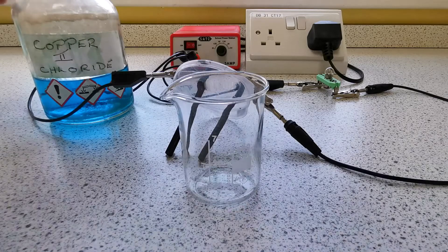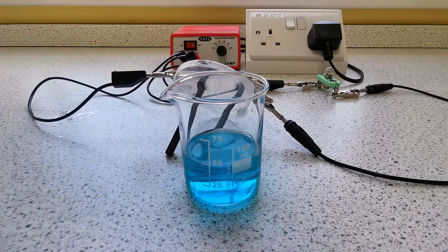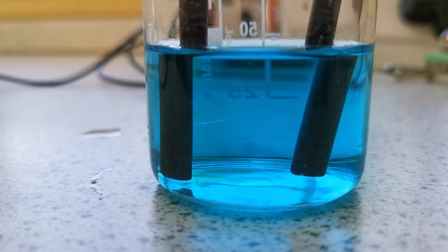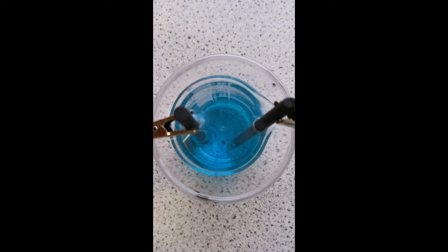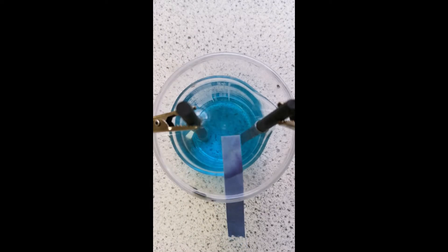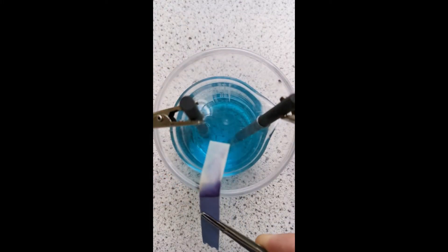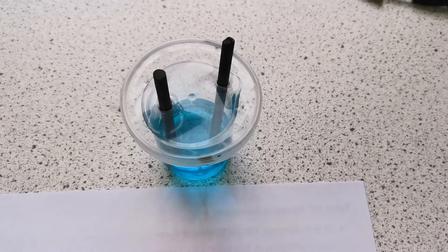I'm going to repeat the method again, this time with copper chloride — once again 50 milliliters. Then we're going to put the electrodes in and start the circuit. As you can see, we have a gas being produced at the anode but no gas being produced at the cathode. I'm going to test for the presence of chlorine gas using a piece of damp blue litmus paper, trapping it between the lid and the beaker. As you can see, the chlorine gas has bleached the damp blue litmus paper and it's turned white, confirming that chlorine gas was produced at the anode. And if we lift the electrodes out of the solution, you can see that the cathode has turned orange-brown — it has been plated with copper.